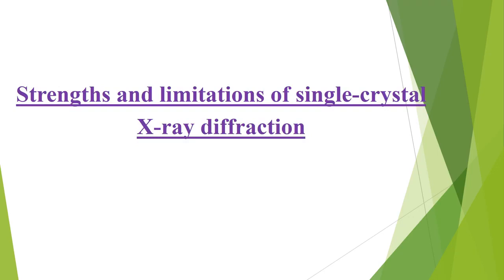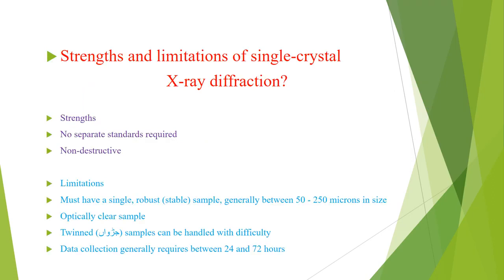So here we are going to discuss the strengths and limitations of single crystal X-ray diffraction. First, we are going to discuss the strengths of this technique, and then after that we will have a look at some limitations that occur using this technique.